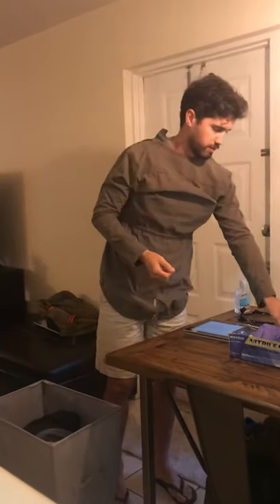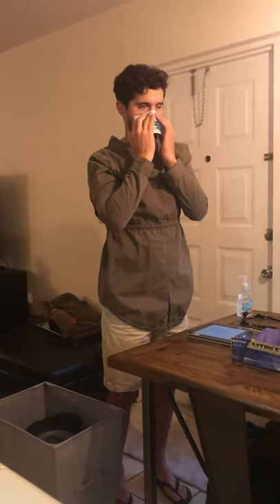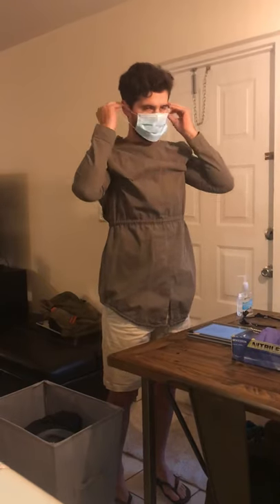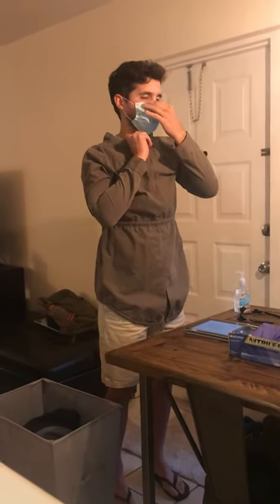Okay, now we're going to go on to our face mask. We're going to fit the top fitting over our nose. Press that into the fold of our nose. Extend the face so you get a good seal off of the mask, just below the chin.